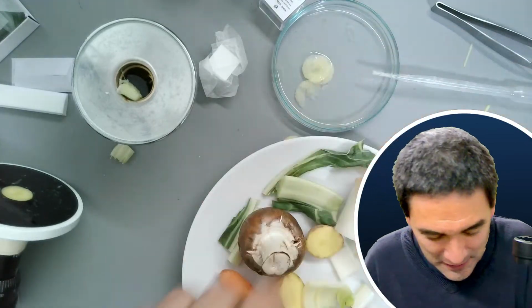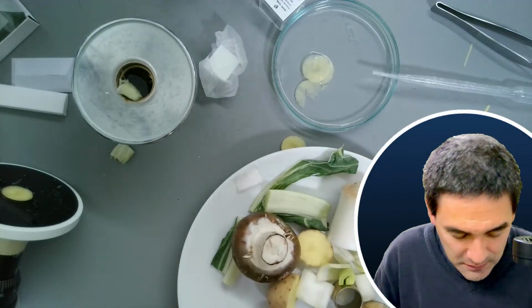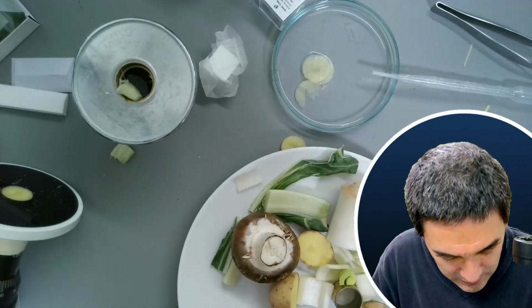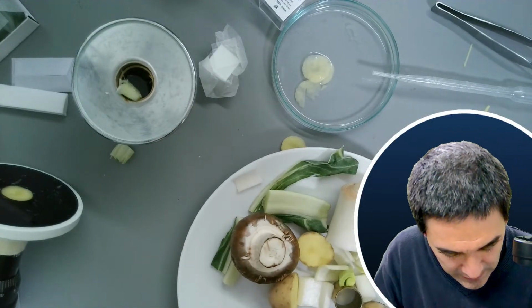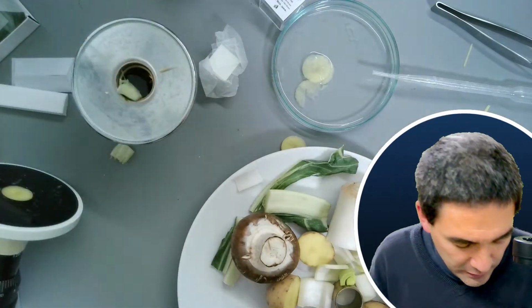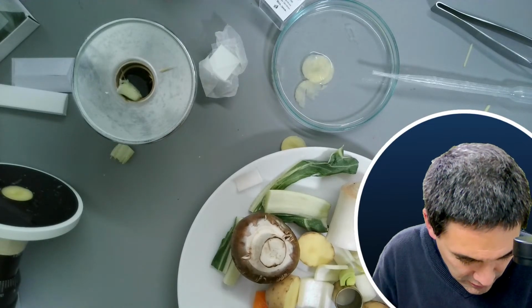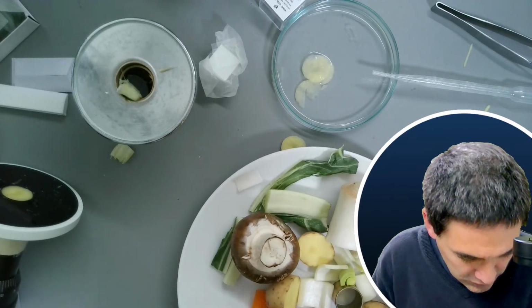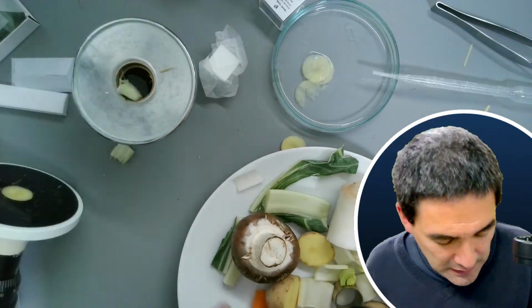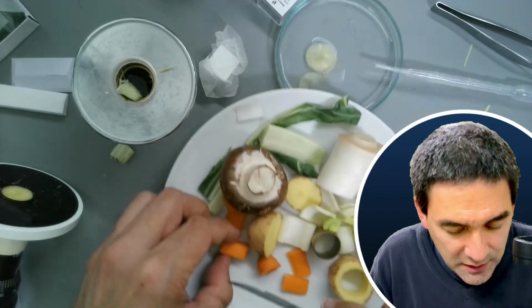So let's do the following here. Let's save this for later on. This is the carrot. I somehow have to cut it down a little bit to make it fit into the holder. Maybe that's going to work. And then I make a slice, but I don't cut all the way.